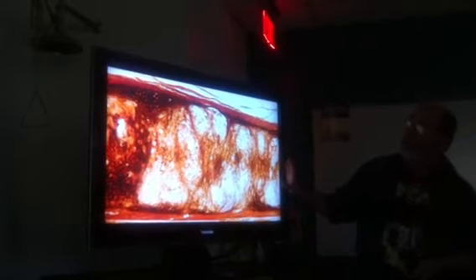Here's the epiglottis, and one of the characteristics of the elastic cartilage in the epiglottis is it's very fatty. And that makes sense. There's an advantage to that because the epiglottis is a trapdoor that goes over the hole of the trachea when you swallow. And this adipose tissue softens it up and makes it form-fit over the hole with no leakage around it. This would not work very well if it was the cartilage that held your ear in shape. This is a more solid cartilage right there, but it's also elastic cartilage.